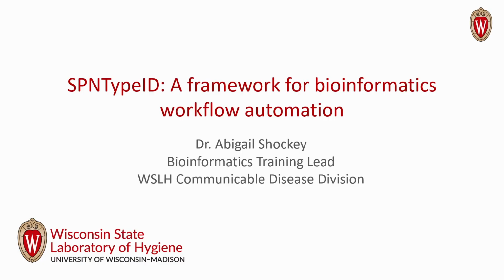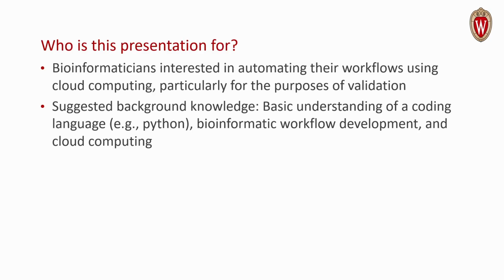I am your host, Dr. Abigail Shockey. I am the bioinformatics training lead at the Wisconsin State Lab of Hygiene's Communicable Disease Division. And today I'm going to be talking about the way in which we fully automated our Streptococcus pneumoniae serotyping pipeline using various infrastructure components to give you an idea and a framework of how you can automate your own bioinformatics pipelines.